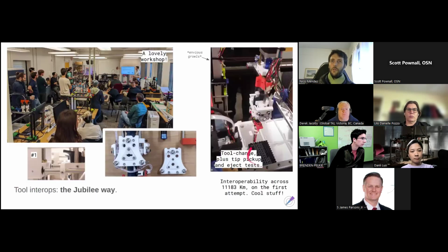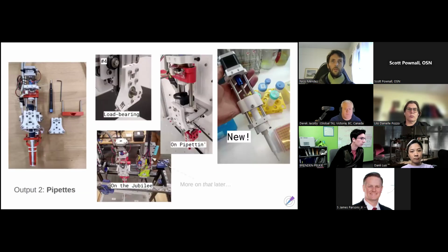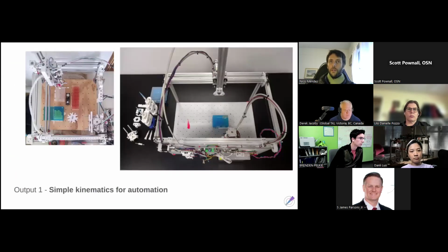So here in Jubilee, you have the deck, the 6-slot deck that is very similar to OpenTrons, if not with the same dimensions. And here you have a grid of holes that are separated by 5 centimeters. And it is not shown very well here, sorry about that. But here you have the curves themselves, so the little L pieces and straight pieces that just fit there. And so you choose your layout and you calibrate it. And that's it.